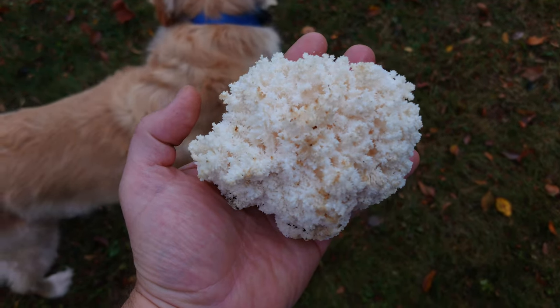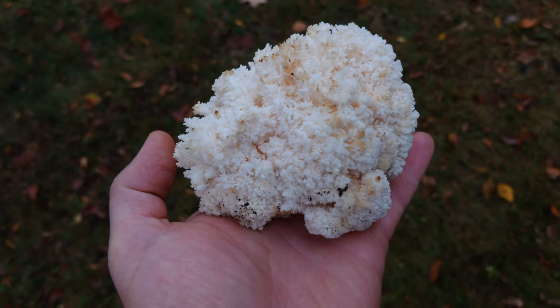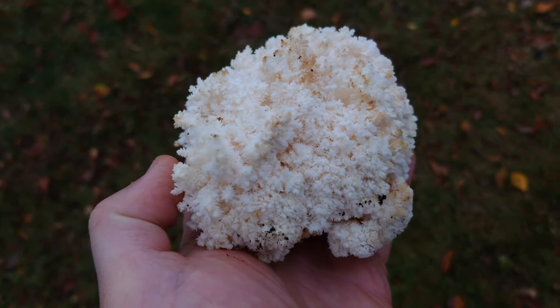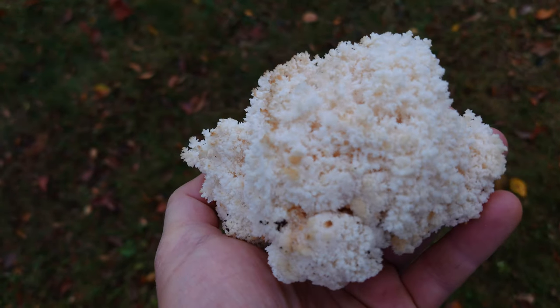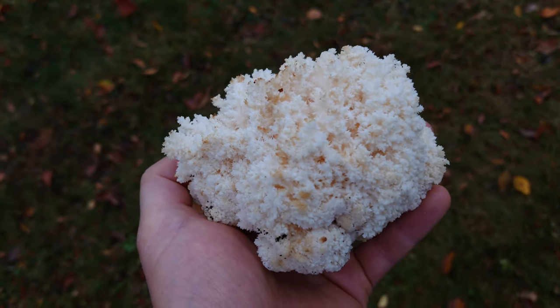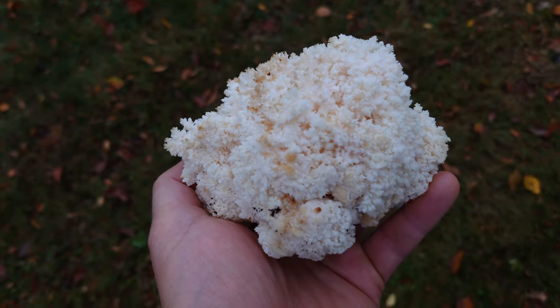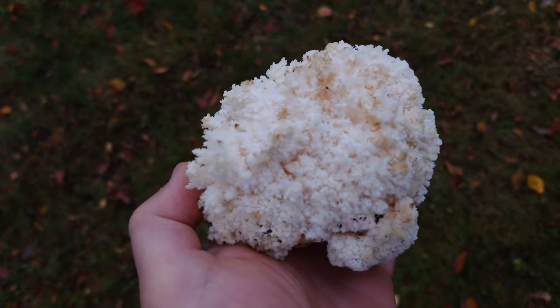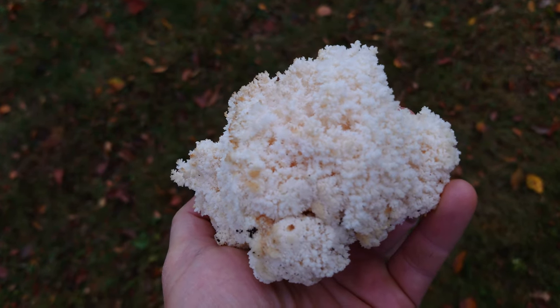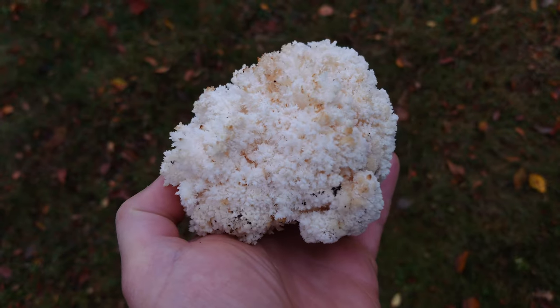We just got back out of the woods and found this beautiful specimen of Hericium coralloides. I'm going to tissue clone this on agar - that's going to be the first step. In this video I want to show you the entire process from wild mushroom all the way to cultivated mushroom: tissue cloning, grain spawn, spawning to substrate, all the way through. Let's head down to the lab.